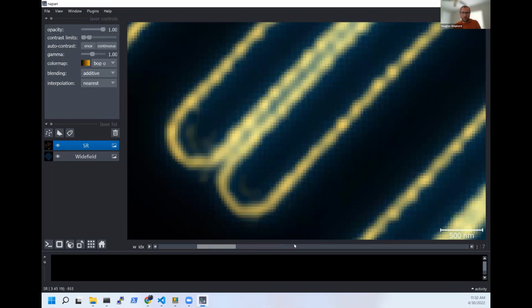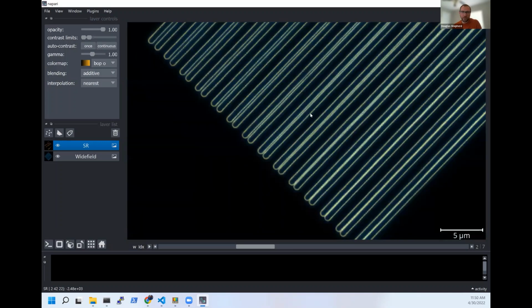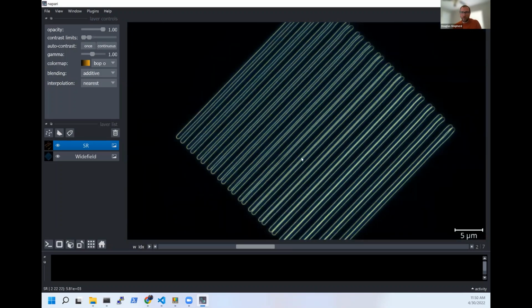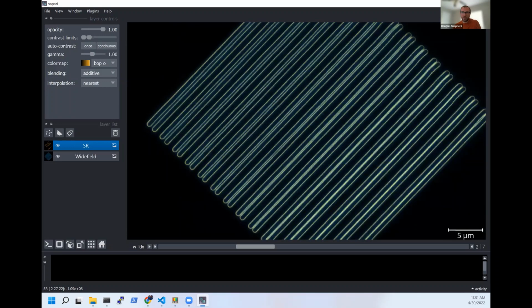And so how Peter suggested to diagnose this, looking at hammer stroke and looking at the Fourier transforms, is the correct way. But I just wanted to give us an example of what that would look like here. And so again, you can run this on your own and play with it. You could try other Wiener parameters. You could go all the way out to 1 and see what it does. And so this is a really nice sort of test about what the reconstruction algorithm is actually doing.